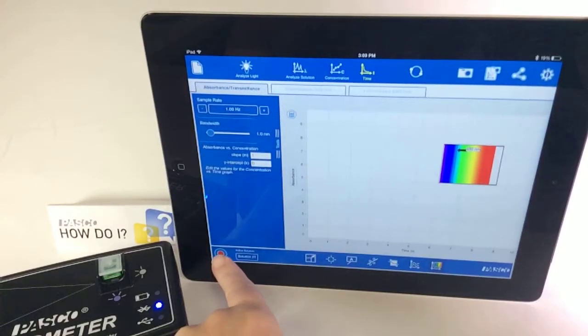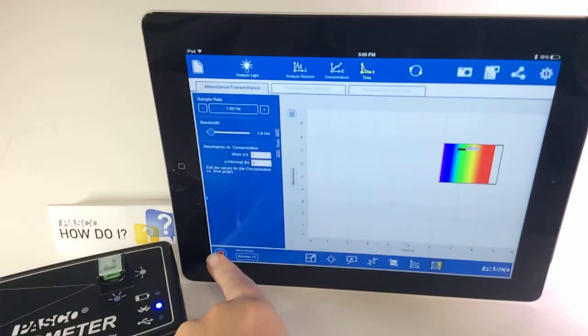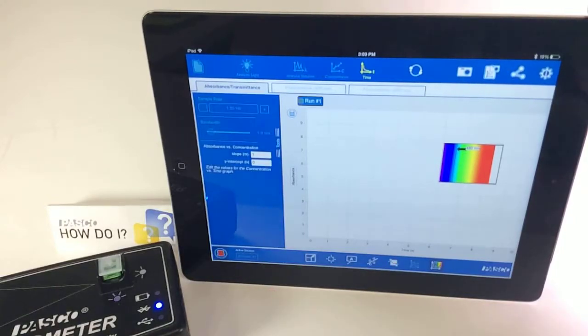I'm going to leave it to the default sample rate of one data point per second. Select data recording.